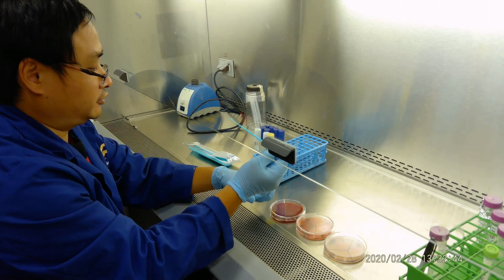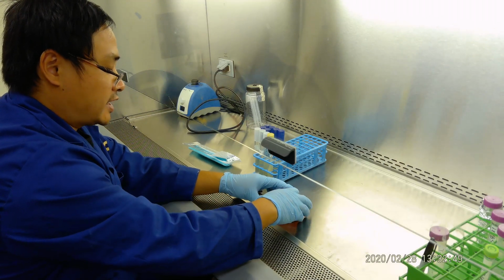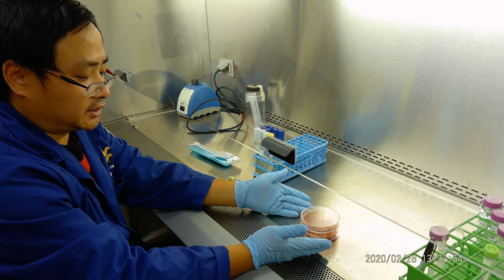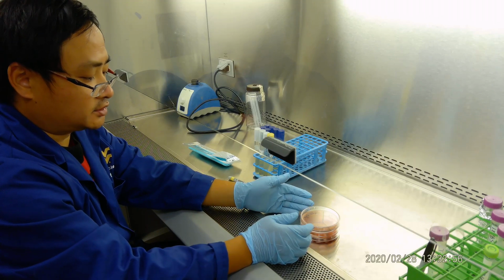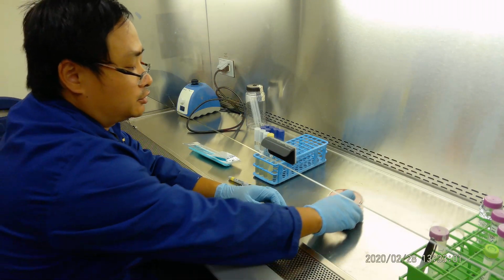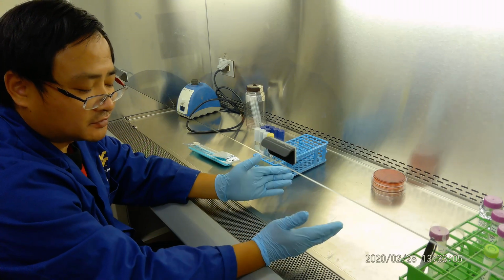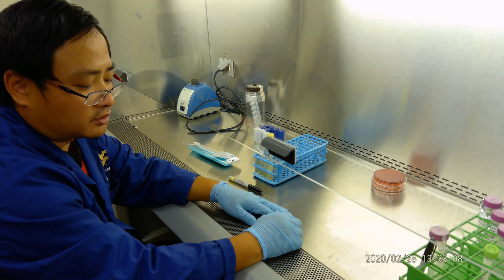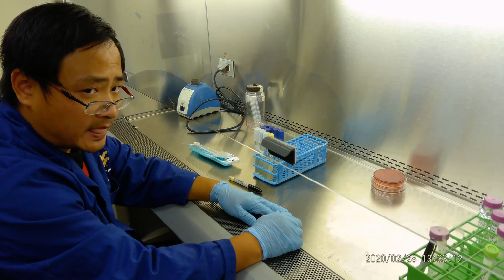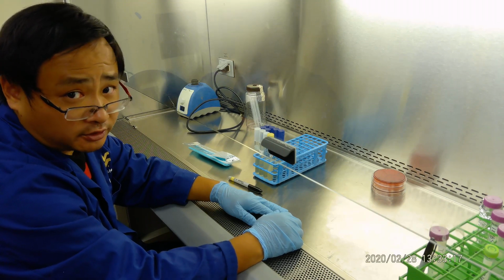Okay. Now after doing this, it's very simple. All of these we have to stack, leave at room temperature a little bit, about 3 to 5 minutes. Then we flip it over to do the incubation. We want to see their growth status after about 24 hours at 35 degrees Celsius, especially whether they grow or not, and their morphology. Also we want to see beta and alpha hemolytic.